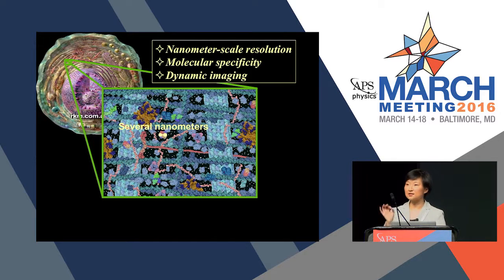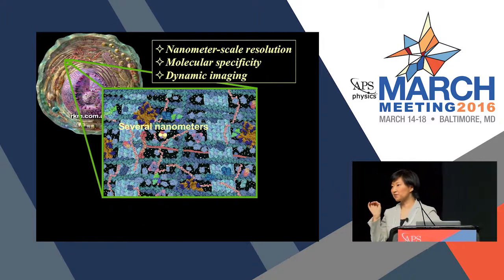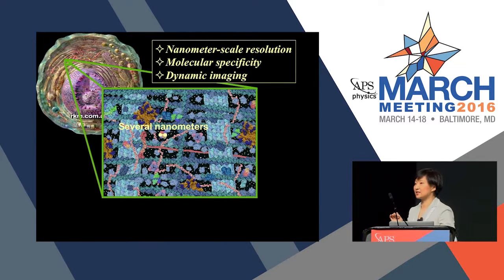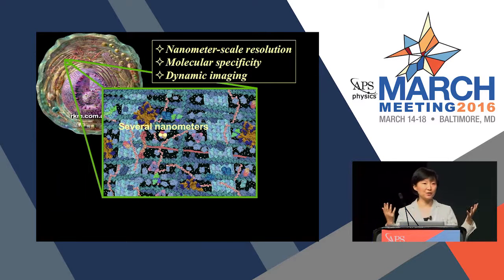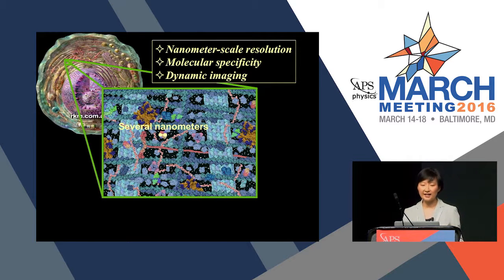That's because there are so many different colored fluorescent probes. Some of them are small molecules like organic dyes. Some of them are actually proteins that glow, called fluorescent proteins. And they can be linked to your molecular target with exquisite specificity. So you can combine this with multicolor imaging and use multiple colors to identify multiple species simultaneously and get your molecular specificity in your images.